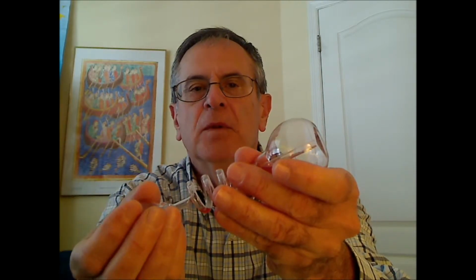And what I'm going to do is support it in this position and apply gentle heat to this side and immerse it in cold water on this side, and that will cause the vapors to rise and go down this tube and condense in the cool part of the apparatus.